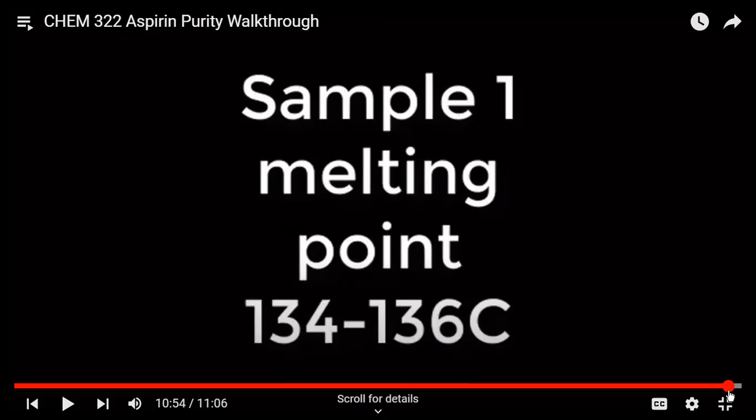What do we fill in for the pure melting point? Yeah. What sample? For me, it's 1. Okay, but so you'll put these numbers in right here. In trial 1, 134 to 136. Right, you have the crude, right? 110 to 115. Yes. Okay, so if you're using sample 1, this is the number that you would use. So we put this for trial 1 and pure?